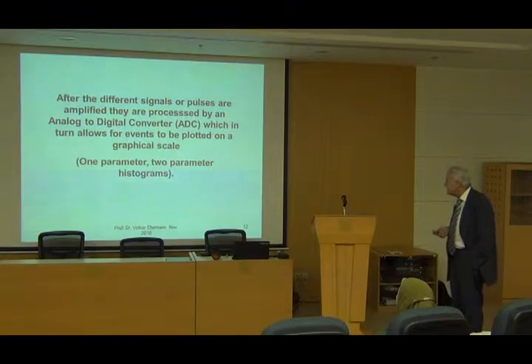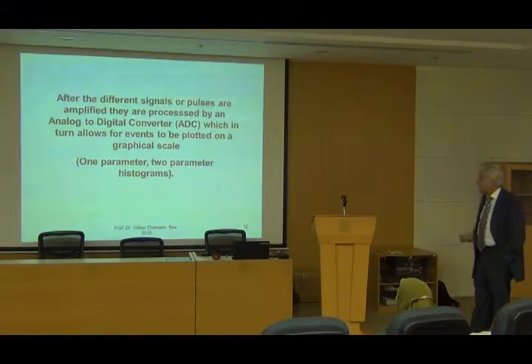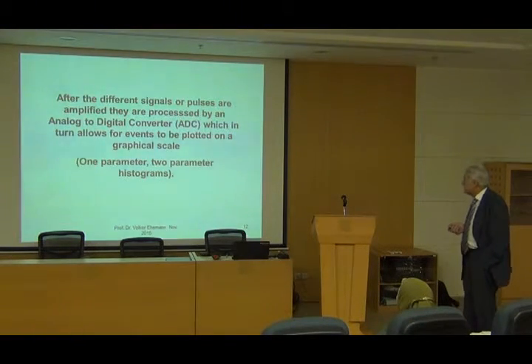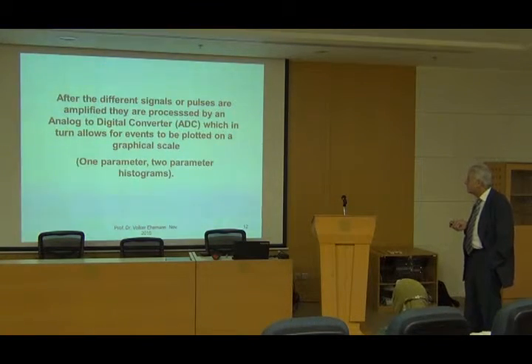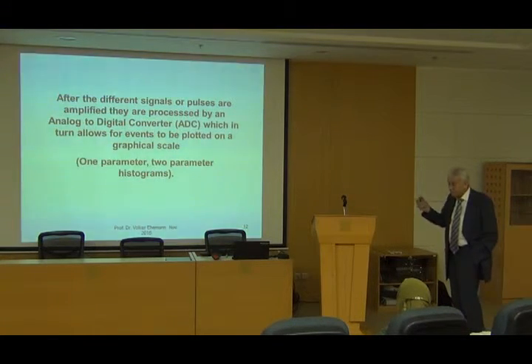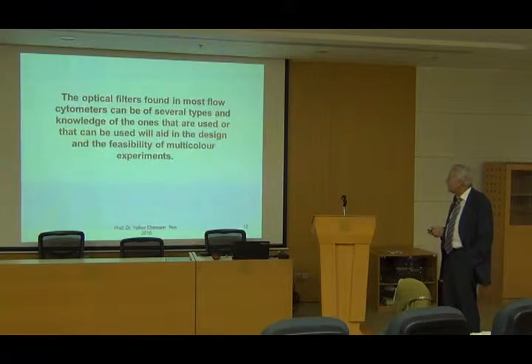After the different signals or pulses are amplified, they are processed by an analog-to-digital converter, which in turn allows events to be plotted on a graphical scale for one-parameter, two-parameter, or multi-parameter analysis.